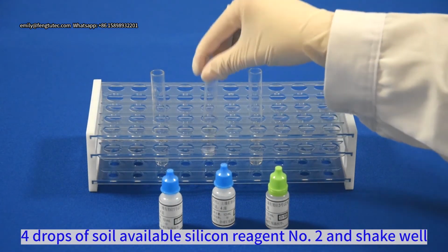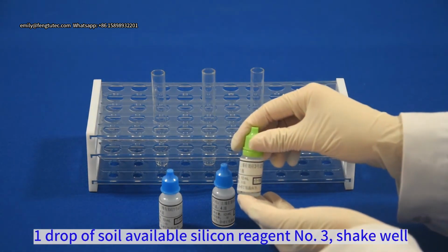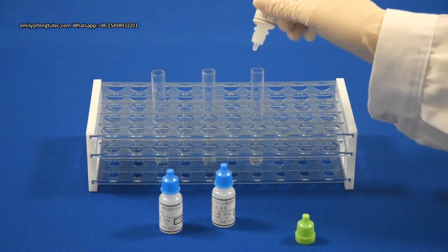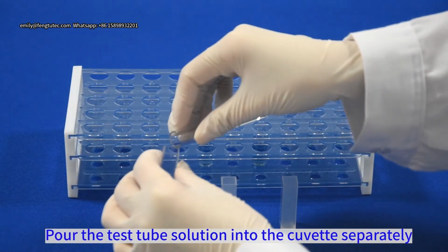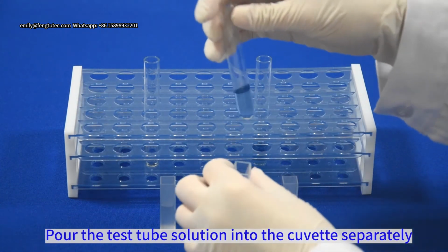After cooling, quickly filter with quantitative filter paper. Then test the available silicon.